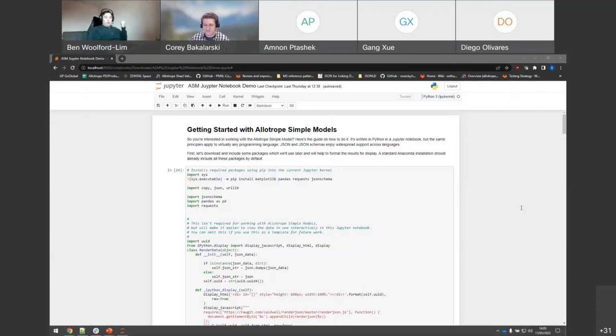So for example, models which are in the graph form, some of the LCUV examples, the mass spec examples, cannot be converted into an ASM at this point because the models are different, and so the translation does not work. It only works for the tabular models. But yes, in terms of converting ADF files into ASMs and back, that is now possible through that tooling. Great. Thank you.